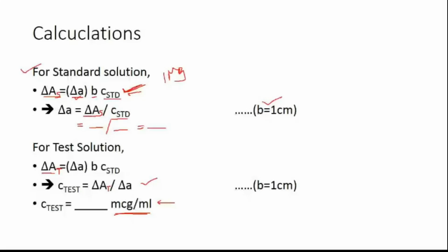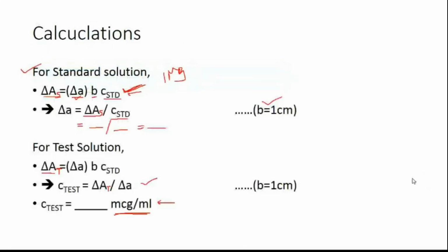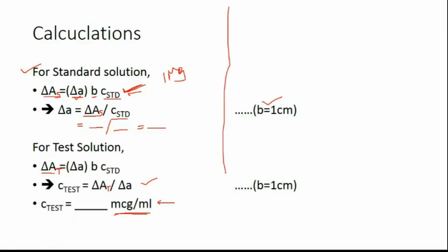Okay, if you have understood the calculation, please proceed for it and tell me what concentration you get for your test. Okay, so I am keeping this calculation slides on. Proceed for calculation and everybody will tell me your concentration of test. Excellent. For people those who are getting the answer, I am writing down next what to do. Acha, before I write what to do next, can anybody guess what to write? Those who have completed can answer. Multiplied by dilution factor. So excellent.